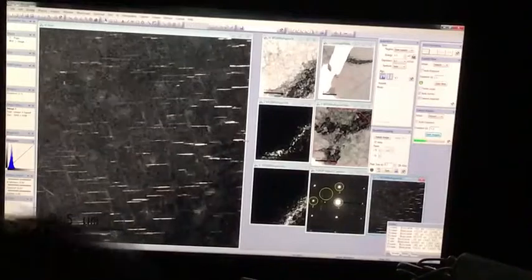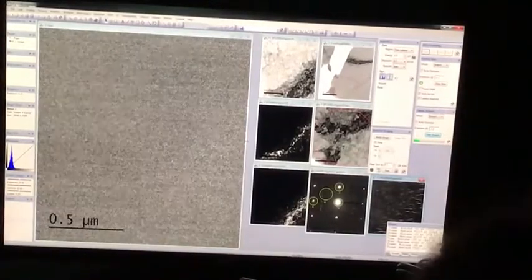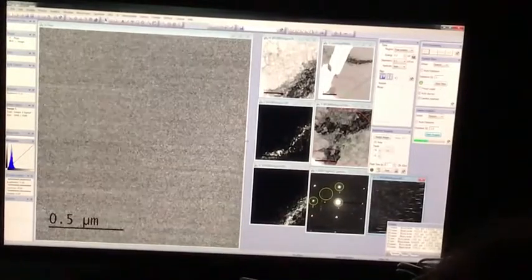So let's see if we can go for yet another orientation. One more, and that'll do. Because I've actually got enough material now to solve this problem. And so I have moved the aperture to this location.